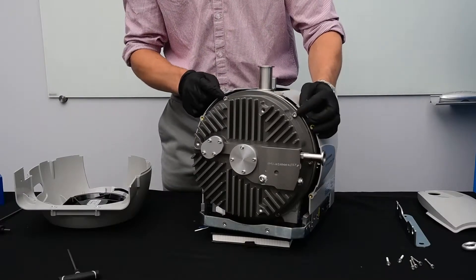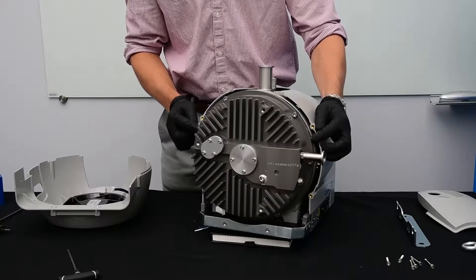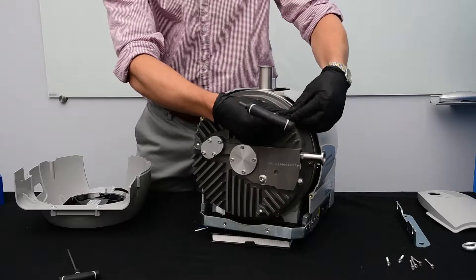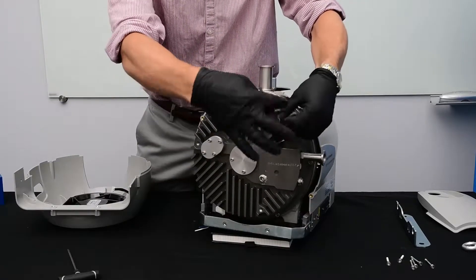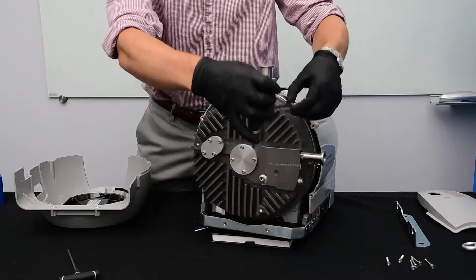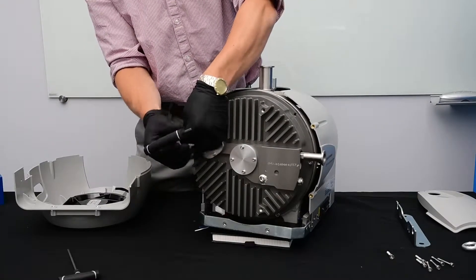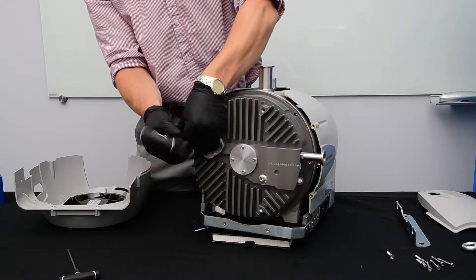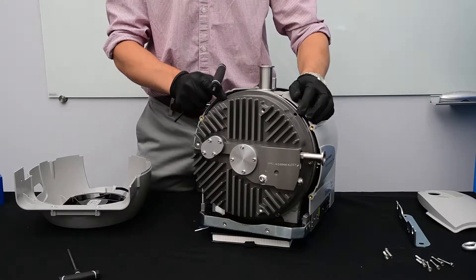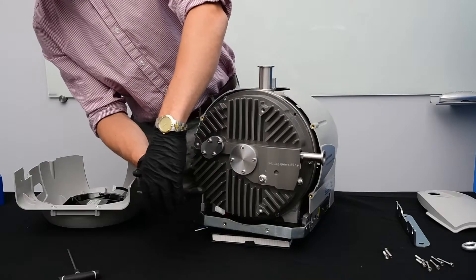Next comes the five millimeter Allen head bolts to remove the outboard housing. I'm leaving one screw attached up top in case this comes off easily.